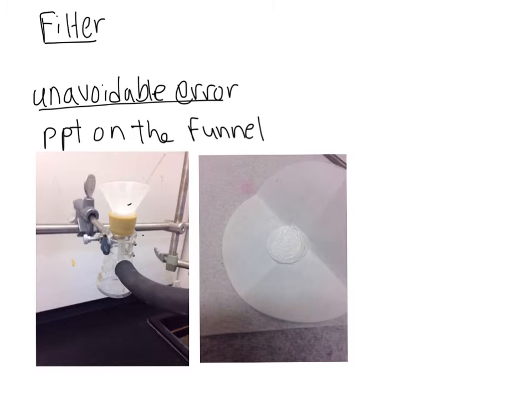And one of my errors, or I made a great mistake here, is that the funnel had a lot of my precipitate on it, and I couldn't really get it. And this is one of the reasons why my recovery was pretty low.